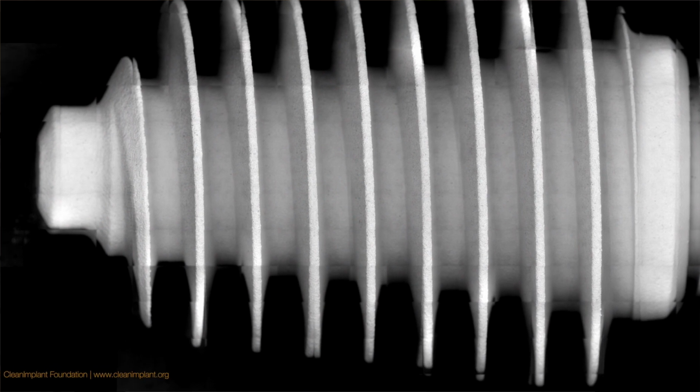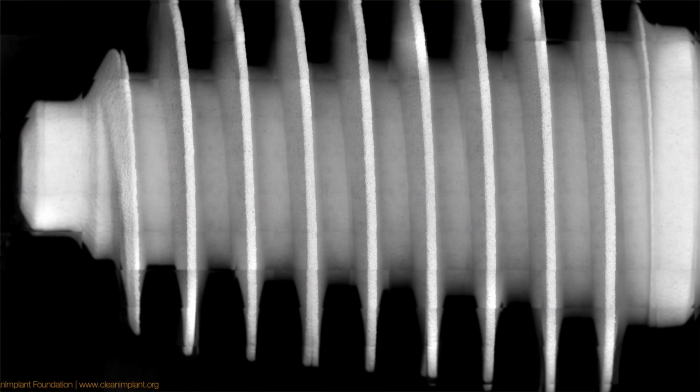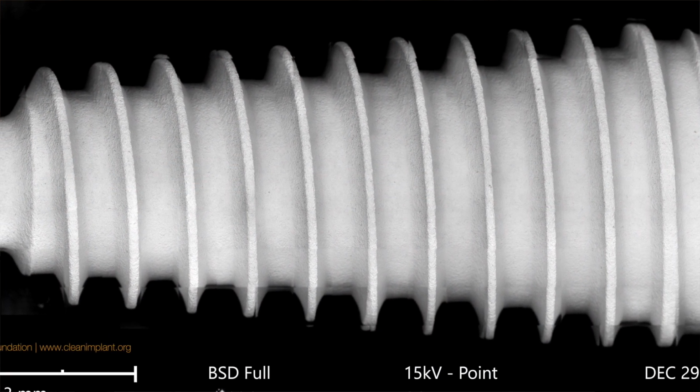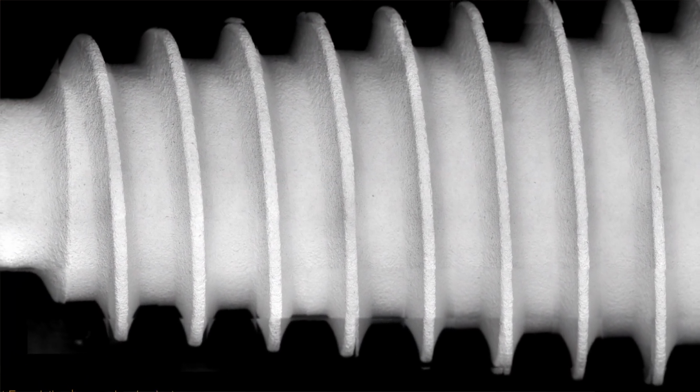This is how a clean implant looks in detail in the material contrast mapping images. A technique where we collect more than 400 single SEM frames and compile them electronically to form one big image of the complete implant. You can see the surface from the implant's shoulder to the apex in a breathtaking magnification. No cherry picking of nice looking areas. We always have to see the full implant as a basis for any rating.